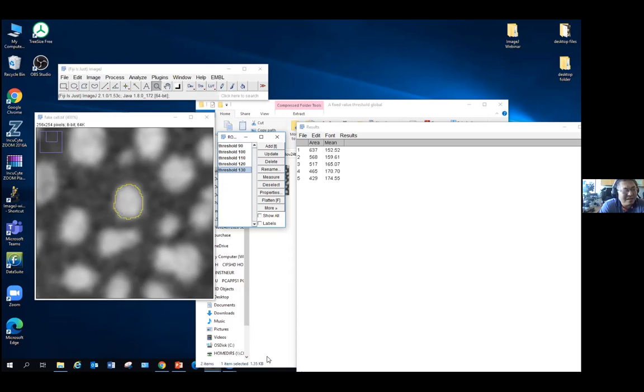So let's go back to our point. We said the thresholding is basically the centerpiece of all the digital analysis. How do we avoid our subjective bias on this? When you're first looking at an image, what thresholding to choose is totally your decision. As I mentioned, it's my data, I understand it best. I choose the thresholding which I believe best represents this cell.